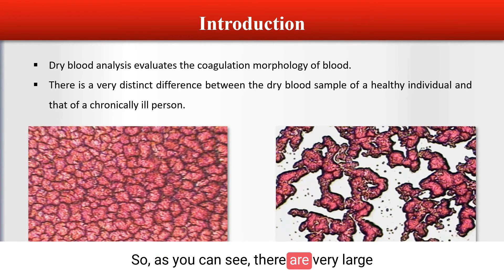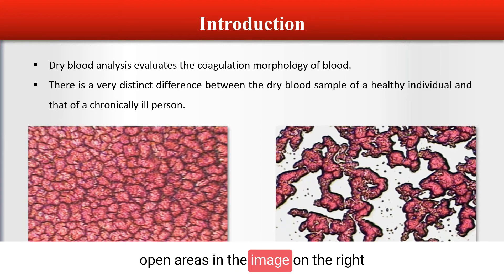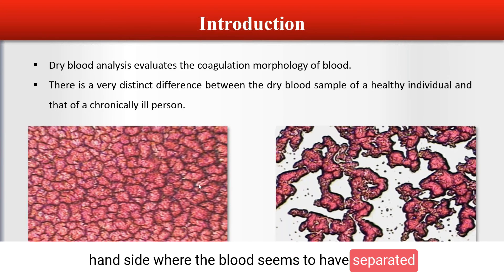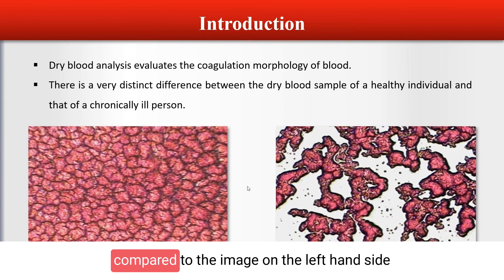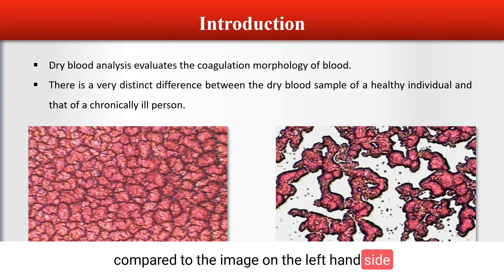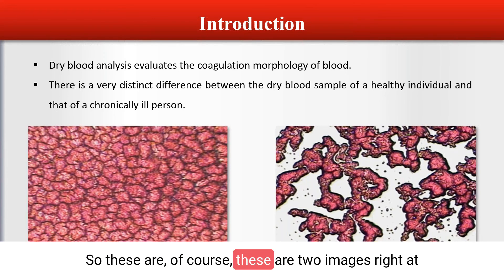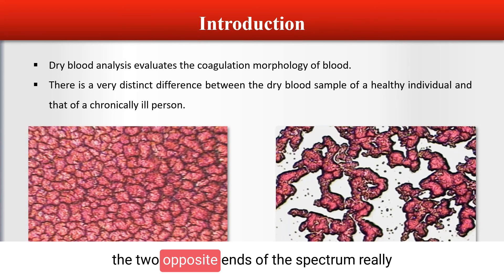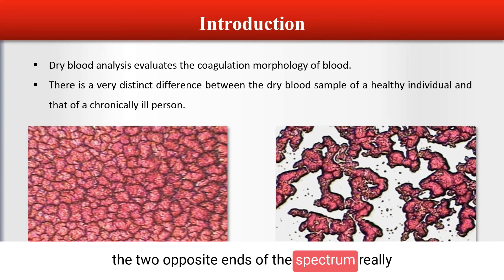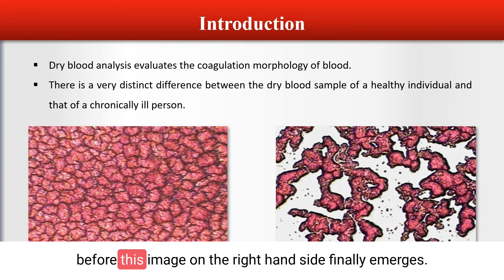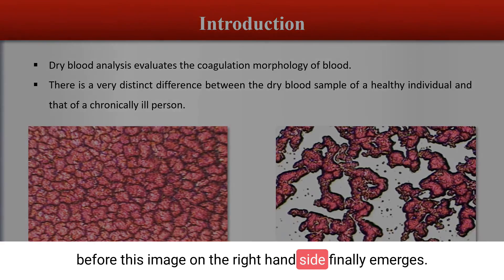As we can see, there are very large open areas in the image on the right hand side where the blood seems to have separated — quite different compared to the image on the left hand side of what normal blood should look like. These are two images at the two opposite ends of the spectrum, and there are of course many anomalies and patterns that we can see before this image on the right hand side finally emerges.